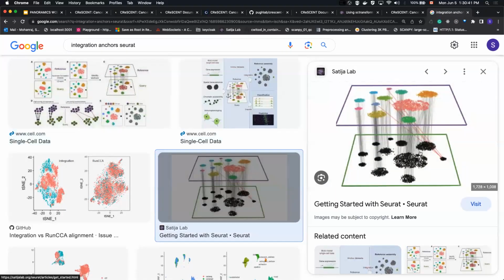So in a way, you can combine different modalities of data, different experiments, different species, even like mouse and human. When you're anchoring these data sets, the similar expressions will anchor together. But as unique clusters are being mapped, they're probably not going to be anchored, or they're going to be anchored randomly, as you can see. That identifies that cluster as being different, and during the integration analysis, more focus is put on that during the clustering.